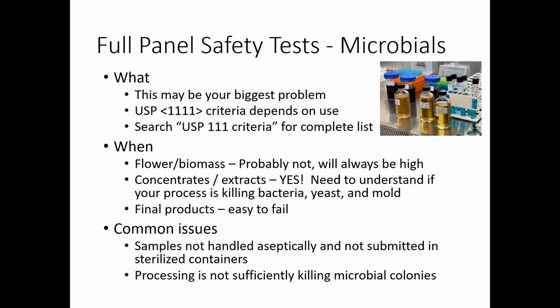So that brings me to the next bullet, concentrates and extracts. This is one of the areas where I would absolutely recommend testing your microbial and making sure that your processing is actually killing all the bacteria, yeast, and molds that you need to kill. It's kind of hit or miss. Sometimes it seems like it should be killing it, and you're only knocking down one.